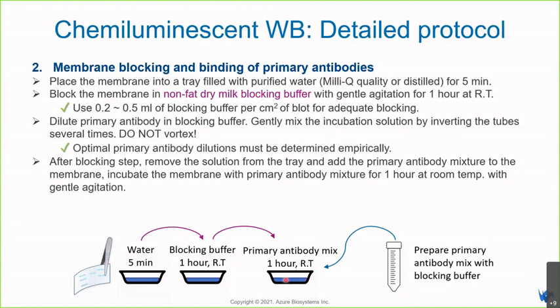Right. Antibody can be added into a dish and placed on a shaker, or you can also use a smaller volume, such as 5 to 10 mL. Use it in plastic bags, seal it with the, what is that called? The heat sealer, and place it on the rotary platform. If you're using a lesser volume, you will save a lot of primary antibody in terms of cost efficiency.